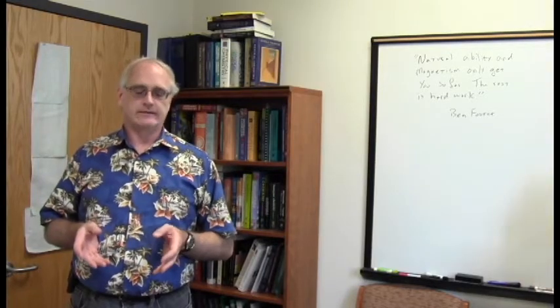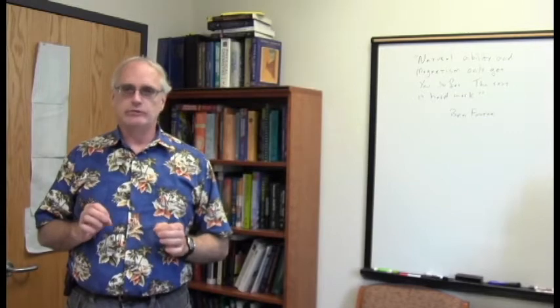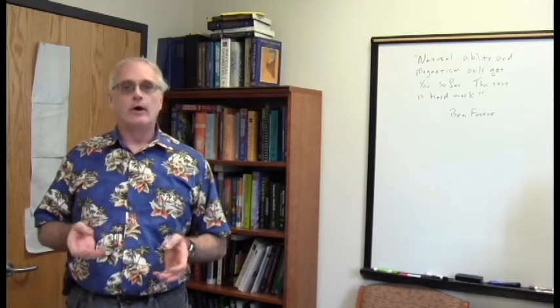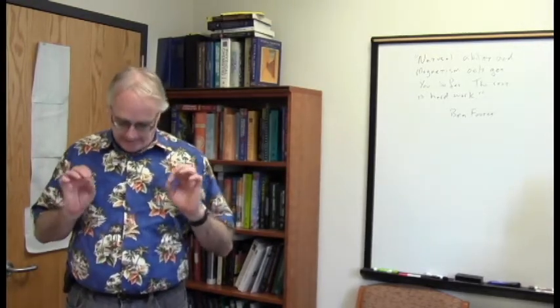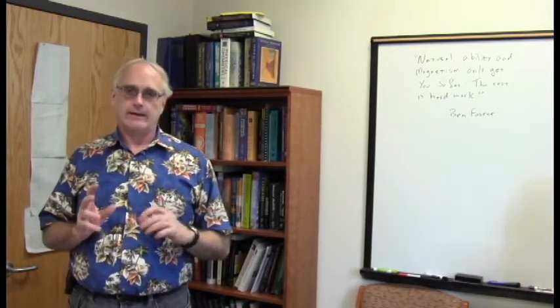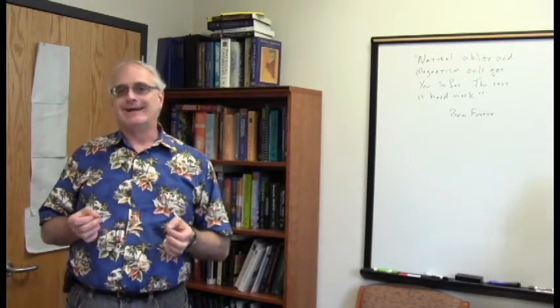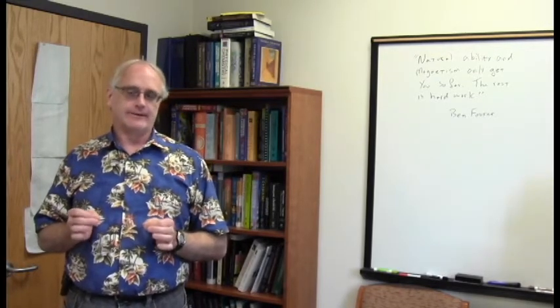Now I want to examine the case of heteroatom protons. They're an unusual bunch, these hydrogens that sit on atoms other than carbon. We find them in alcohols or in carboxylic acids or amines. Their chemical shifts are surprisingly broad and varied. They can be far downfield, but also surprisingly far upfield. From a strict electronegativity standpoint, it's sometimes surprising how far upfield they can be.